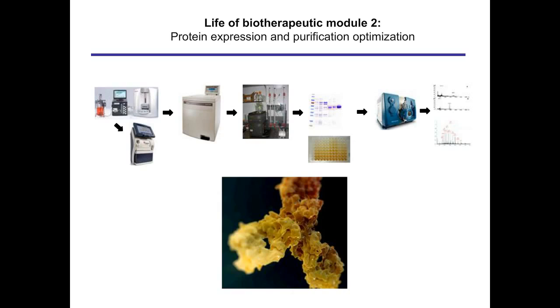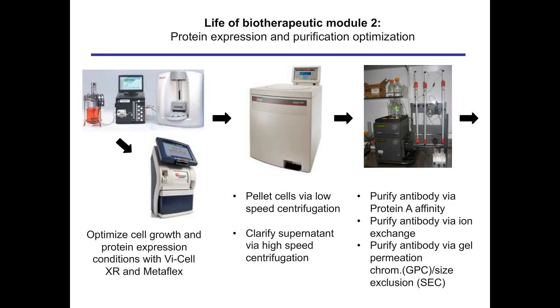Usually there's some centrifugation step depending on the process size, but at small scales, typically a centrifuge is used to pellet cells, and then there's some process of purification via column chromatography, and following or tracking the expression with acrylamide gels and or the functionality using enzyme-linked immunosorbent assay or ELISAs, and then some subsequent follow-up with mass spectrometry to confirm the size and the glycosylation state of the therapeutic proteins. So let's talk a bit more about that.